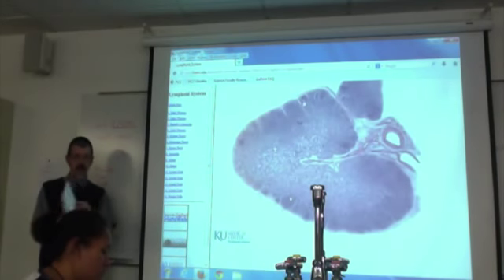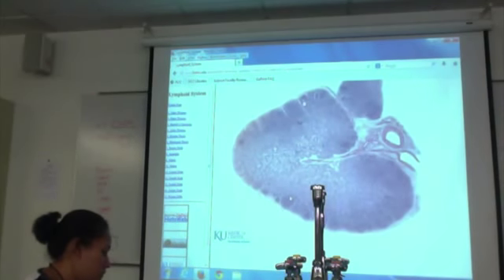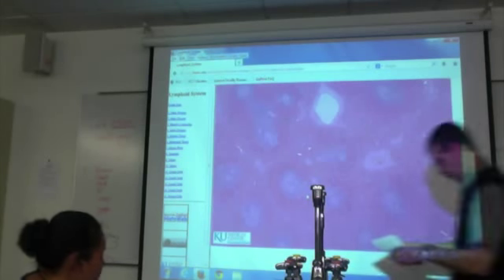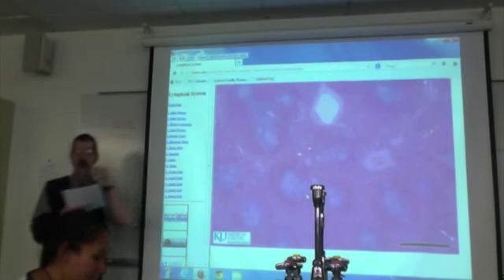Okay, a lymph node. So look for rings of follicles, because the next one I show you will be different. Okay, is this a lymph node? Say no. How do I know it's not a lymph node? It's not in a layer. Notice the circles are all over the map. They're mix and match. They're not in a ring.